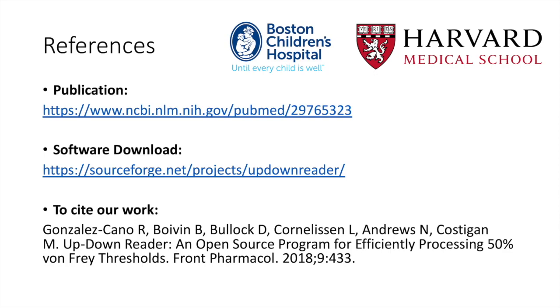What follows is a video which demonstrates how to properly use the Up-Down Reader software.